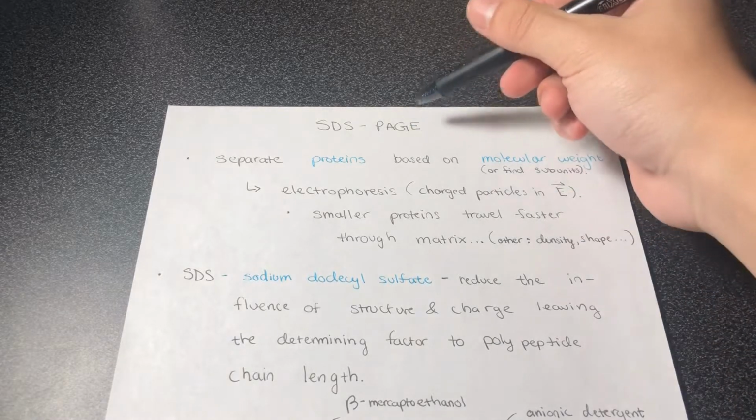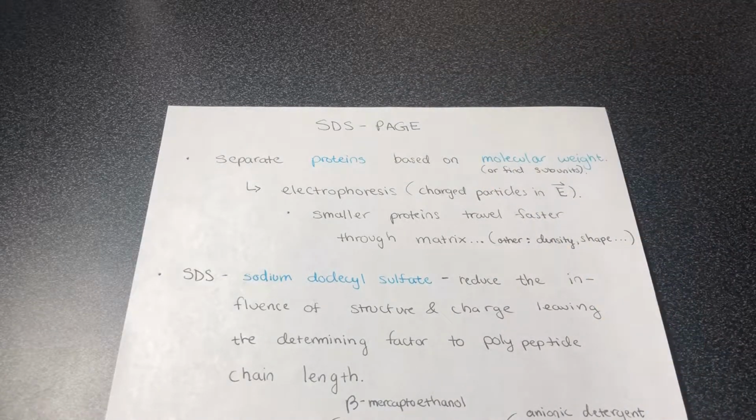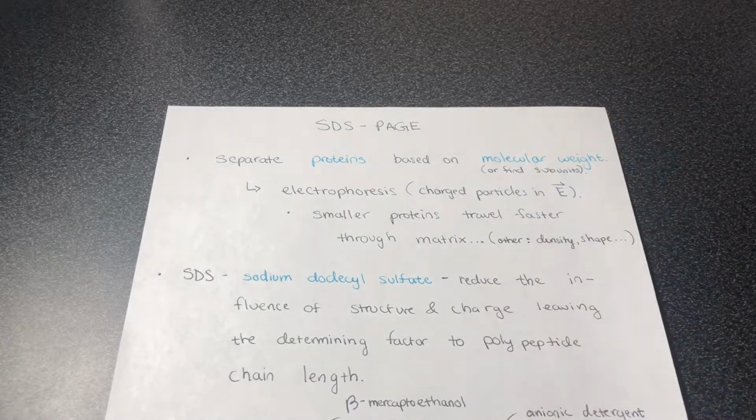PAGE, polyacrylamide gel electrophoresis. So you have some type of gel, and on that gel, you have charged particles, or proteins we're talking about, in an electric field. And that electric field is going to draw the proteins from the negative to the positive end. Smaller proteins in this gel will travel faster through the matrix. That's the gel, right? And you have other factors such as density and shape.